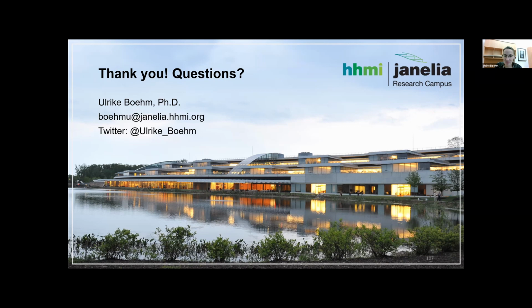And I think one aspect is maybe, oh god, very cheesy response. I know that I'm having long responses here, but I think the technology which is in the best possible way able to capture biological processes and structures with the highest integrity, that's a very broad response, but that really depends on quite a lot. People always maybe complain about the intensities with STED, but STED can follow dynamic processes in a quite good way.